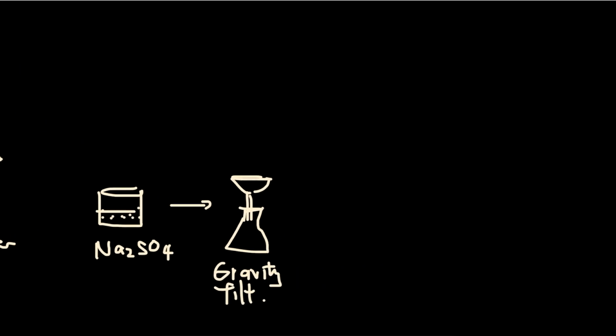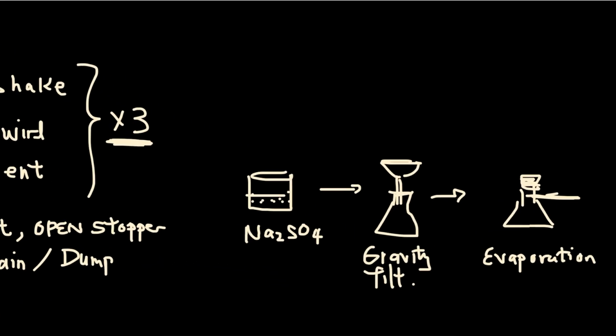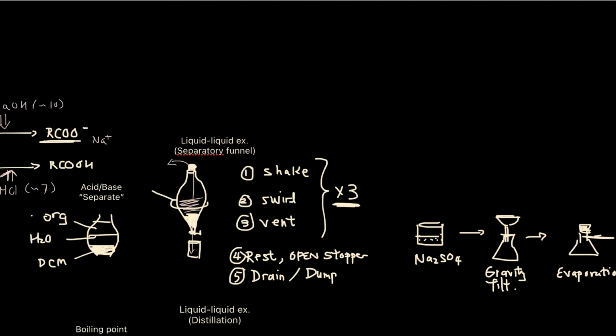And then on the lab exam, they also want you to say you should do an evaporation, and hopefully you still have product at this point. So evaporation, reduced pressure evaporation. And the purpose is to really make sure that the acid or the base is isolated. Yeah, so these are the steps. Oh, by the way, in terms of practical things, once you add this, let it sit for 5 minutes. Otherwise, it's not fun.